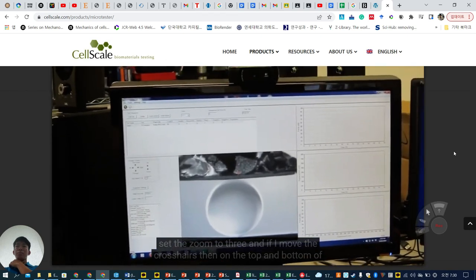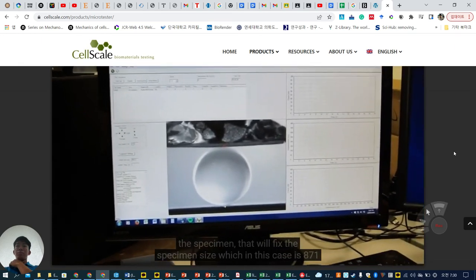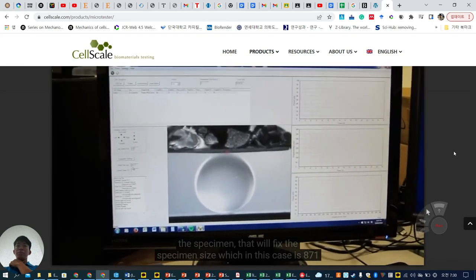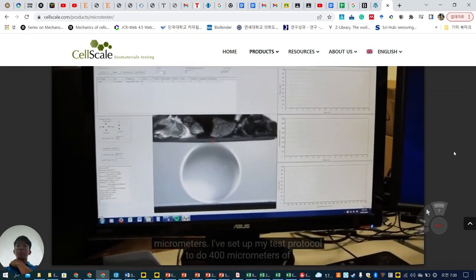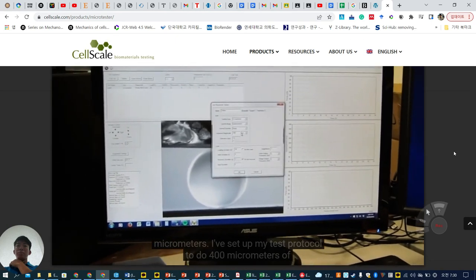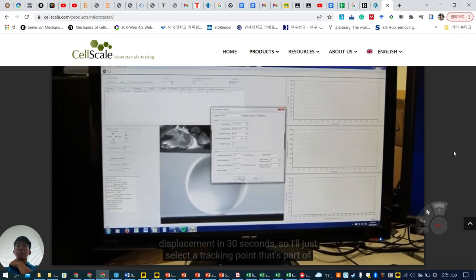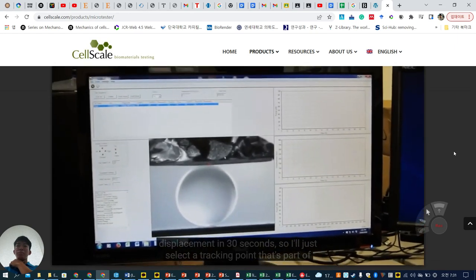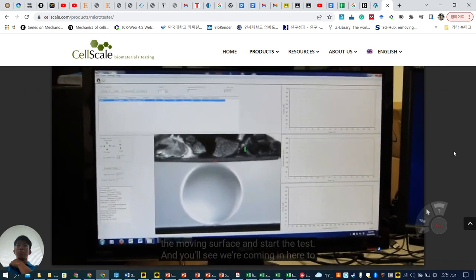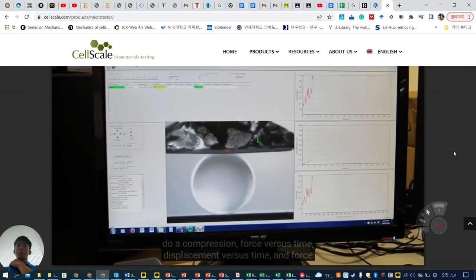I've set the zoom to 3, and if I move the crosshairs on the top and bottom of the specimen, that will fix the specimen size, which in this case is 871 micrometers. I've set up my test protocol to do 400 micrometers of displacement in 30 seconds. So I'll just select a tracking point that's part of the moving surface and start the test. And you'll see we're coming in here to do a compression.